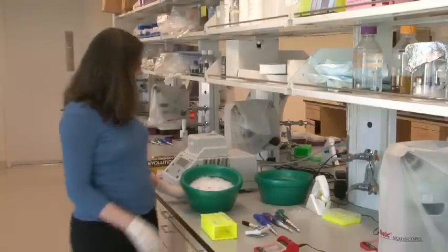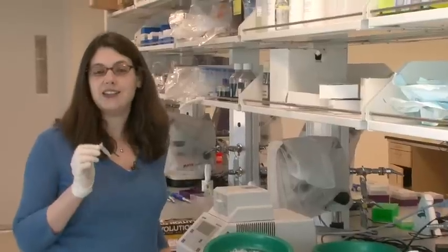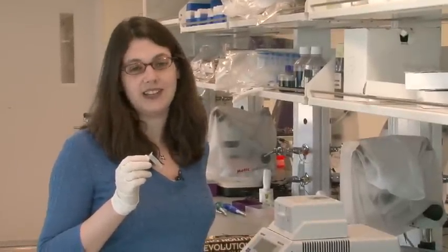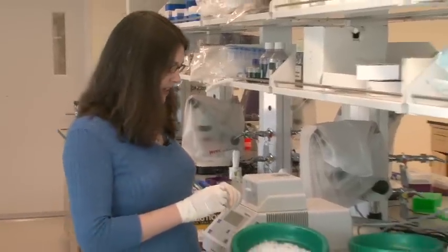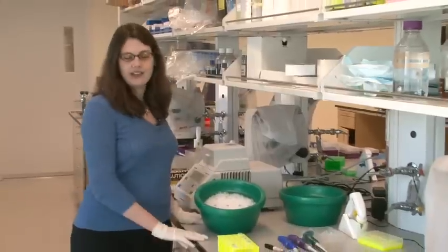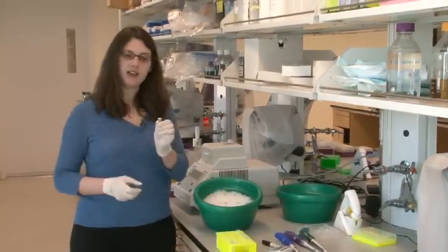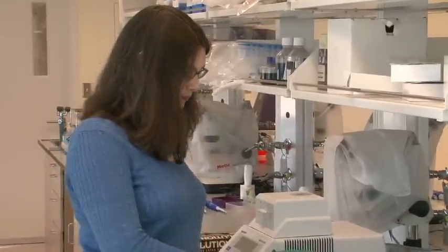So, typically we store our DNA samples like this in these tubes, and I got these tubes out of the freezer. Typically we store DNA at -20 degrees Celsius, which is the temperature of a standard freezer. The first thing that I'm going to do is take a little sample of those samples of DNA, and put them into these smaller tubes, which we'll use to copy the segment of the DNA that we're interested in.